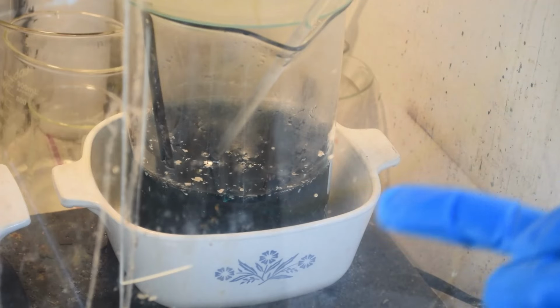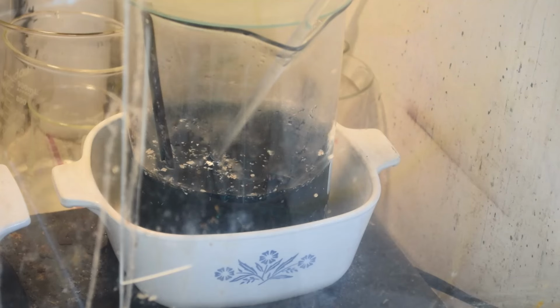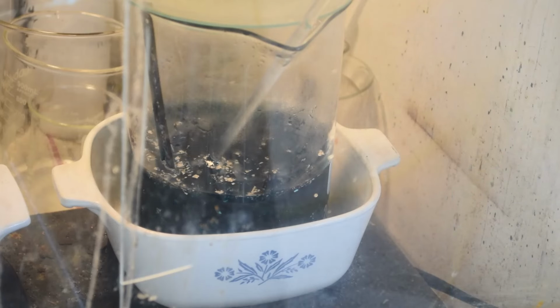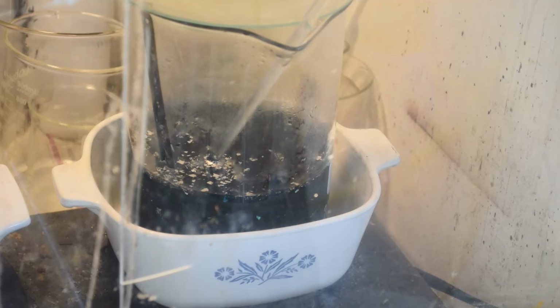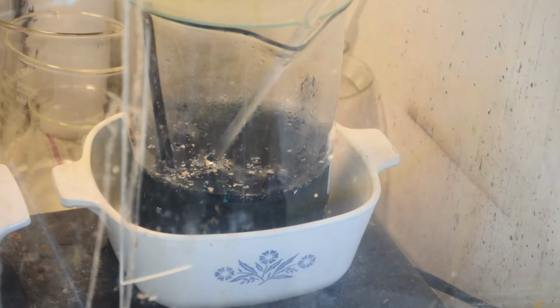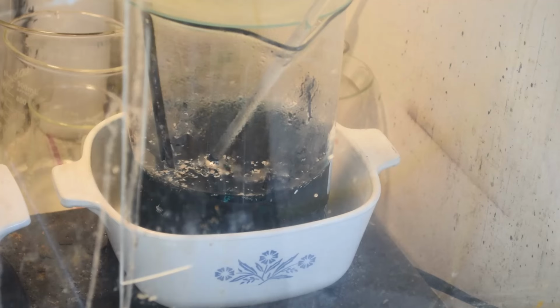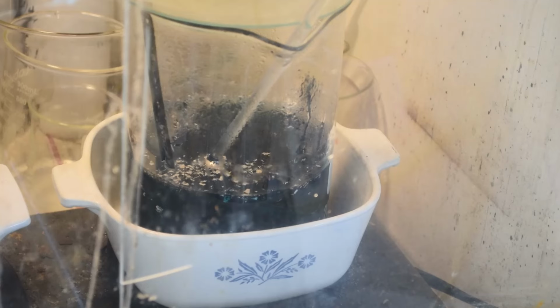I think we probably got some nickel, some copper in here, and some other metal that is not dissolving readily in dilute nitric acid. I know aluminum doesn't, but I don't think that's aluminum. Could be wrong, but I don't think it's aluminum. Assuming it is palladium, well, I could stop the reaction before it goes to completion and separate the foils from the rest of the stuff and then try and dissolve the foils. That might make more sense.